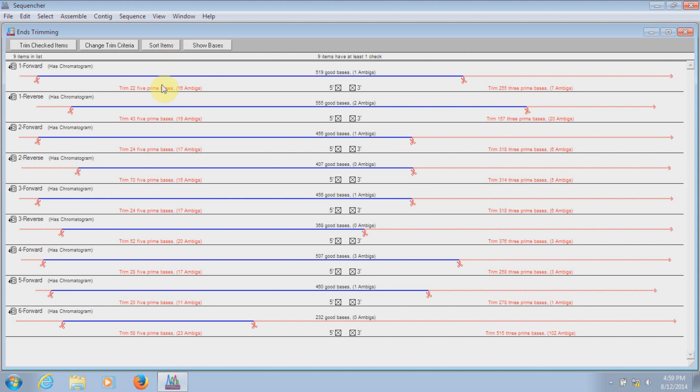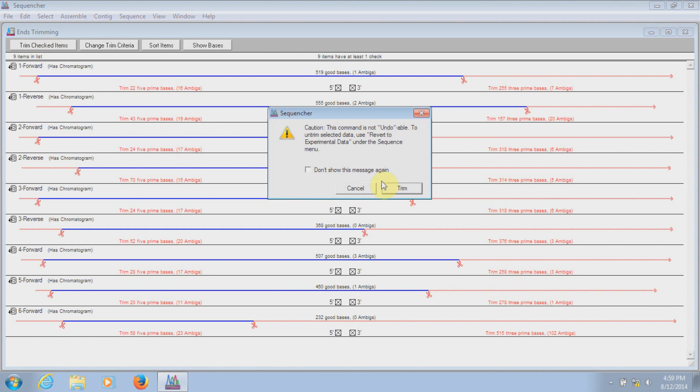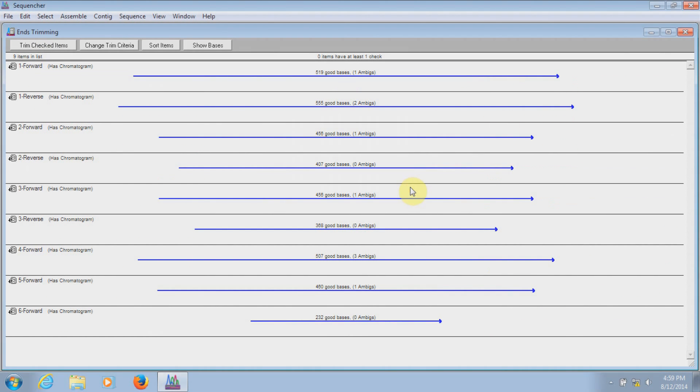So let's go ahead and actually trim the sequences by going to Trim Checked Items. It will give us this little warning window and we'll say Trim. And so now we've trimmed those bases off of each end of the sequences.